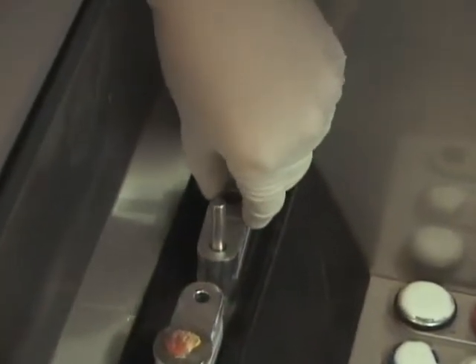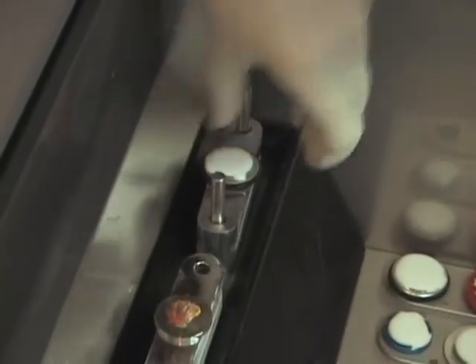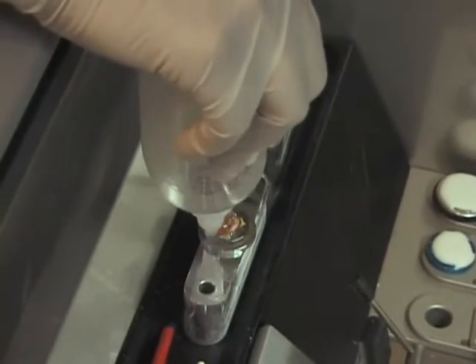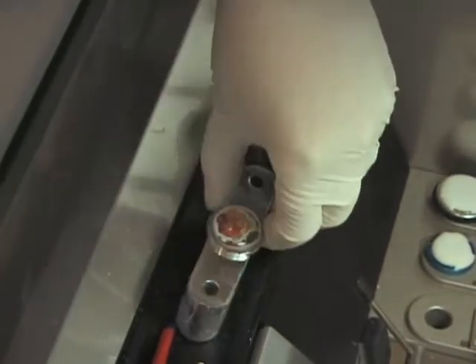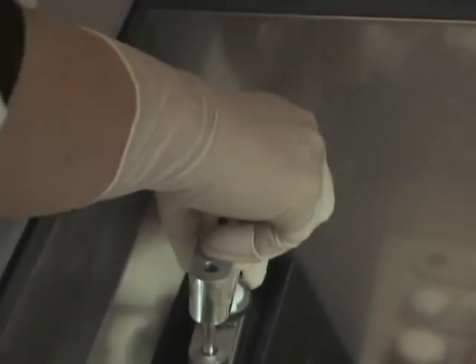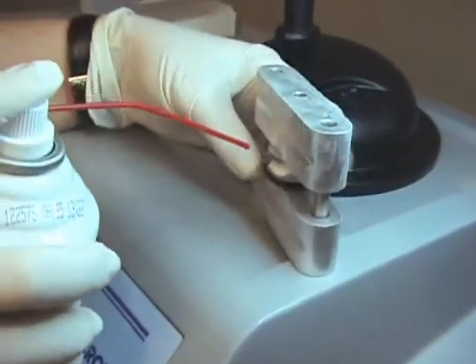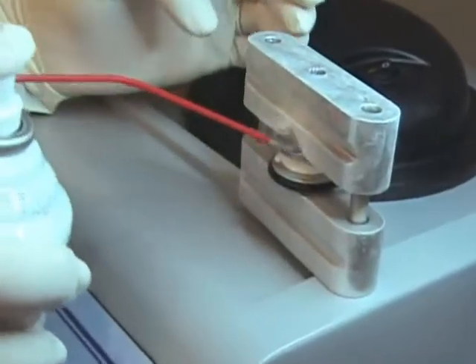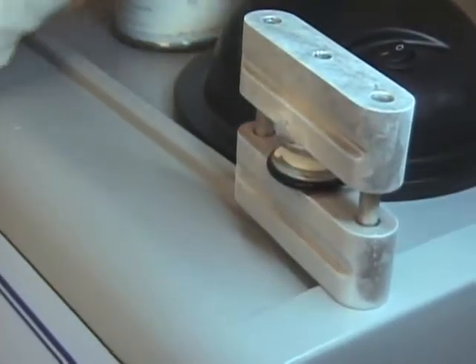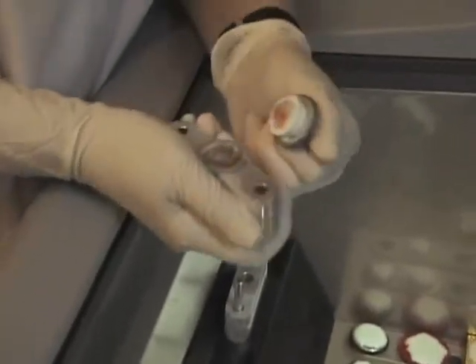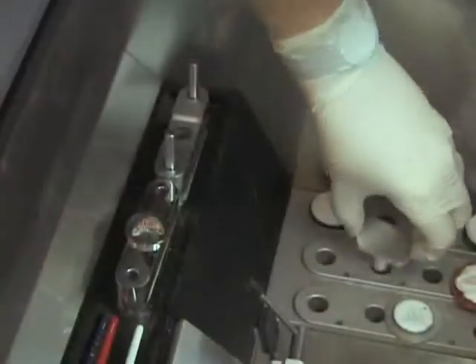This is the adapter for the Leica machine. It works with both the regular and the large Leica chucks. The cryo-embedder never needs replacement parts. The same discs are used over and over again and washed clean with water. The cryo-embedder's design is ergonomically friendly. The discs are rotated and the specimens embedded without movements of the hands that cause carpal tunnel so common to people in this profession. The smooth disc is easily removed from the cutting chucks without the need to partially thaw or twist. They will never break or cut the technician, which can happen with glass slides.